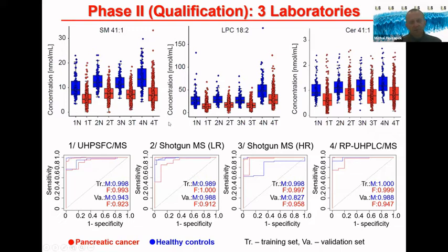I should also add that these graphs were prepared after normalization. If we do it without normalization, then we have a relatively good fit among all lipid class approaches, but we have a certain discrepancy with lipid species separation, which shows that these lipid class approaches are really stronger for quantitation.